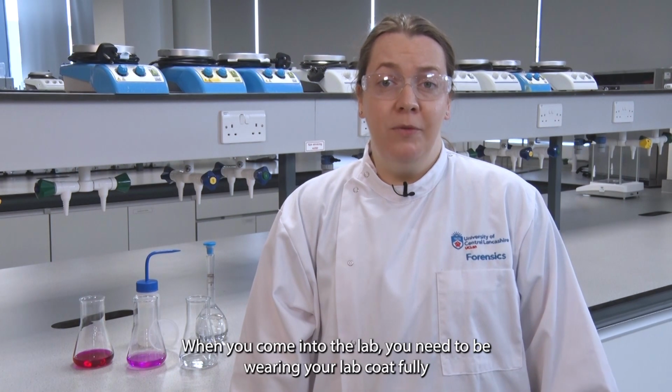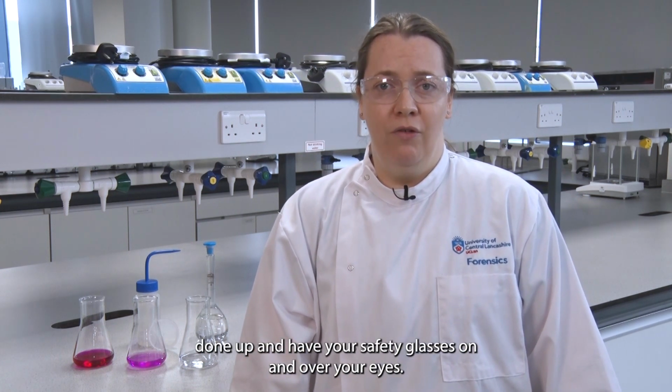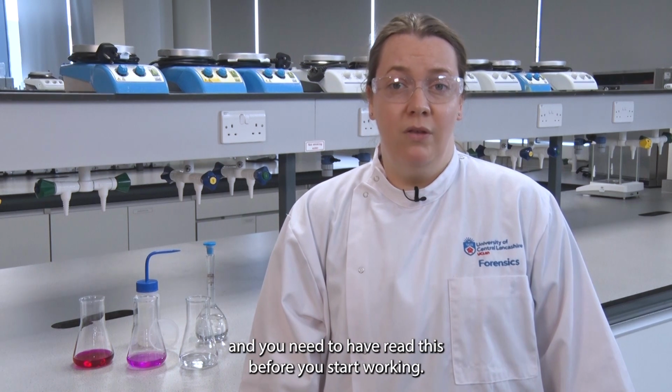When you come into the lab, you need to be wearing your lab coat fully done up and have your safety glasses on and over your eyes. All of the lab scripts contain COSH and risk assessment information, and you need to have read this before you start working.